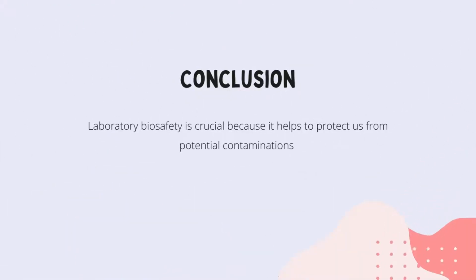Laboratory biosafety is crucial because it helps to protect us from potential contamination.